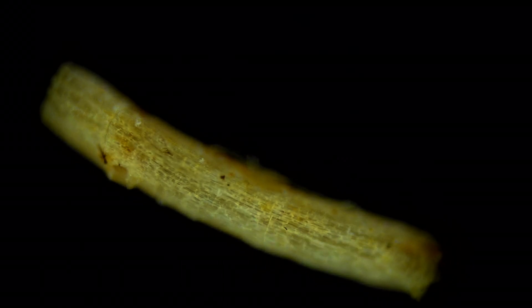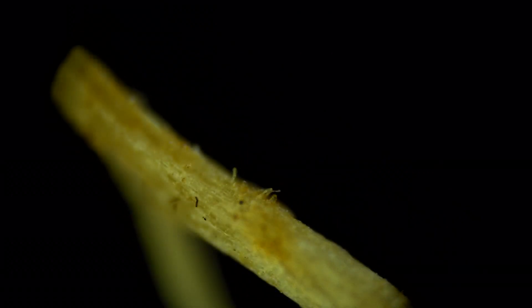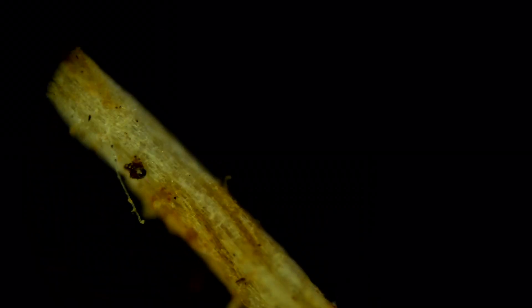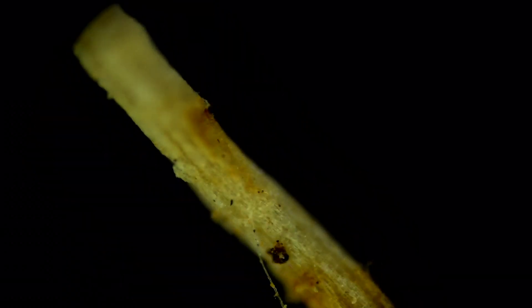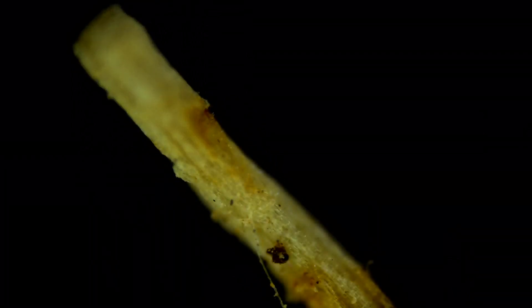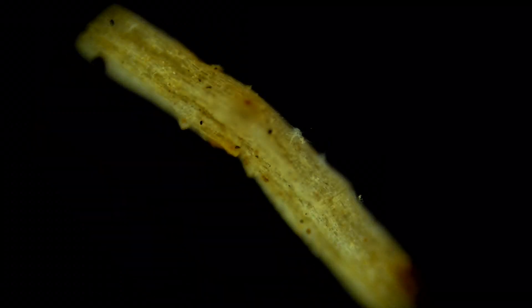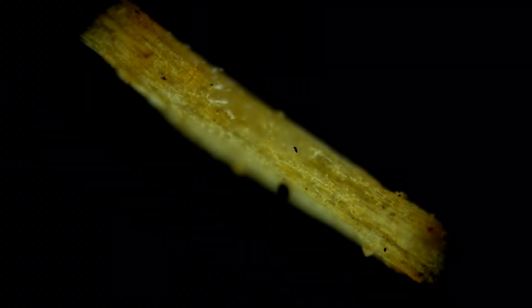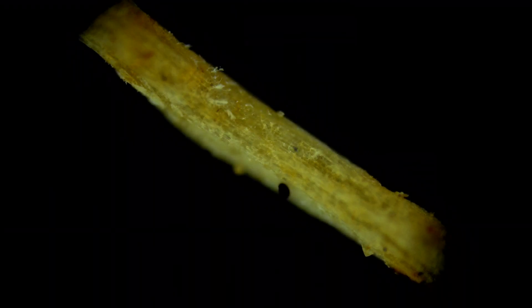Now you can see the individual cells really incredibly well — you can see the surface of things. People like Marc Lafavre are looking at the surfaces of compost. We can see the actual color of things; often the root tip is a different color. Spores — you can identify their actual natural color. You can see some beautiful hyphae here, and all those root hairs — just gorgeous. This really allows us to see things that don't show up in epifluorescence, because it is all natural lighting.